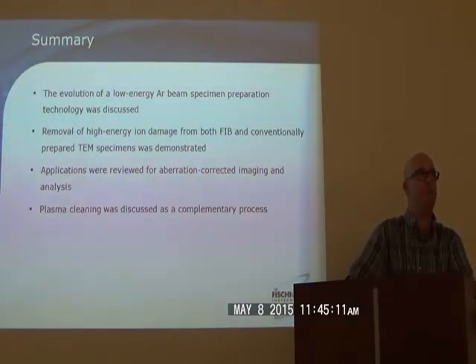What is the energy of the electron source would be in the Pico mill? Does it go up to 30? I don't know, but it might. 15 kV maximum, but we won't run probably that high. Between 10 and 13 for the moment.